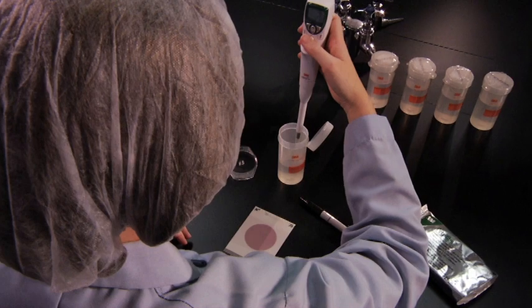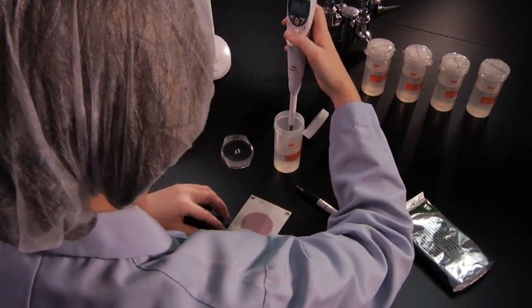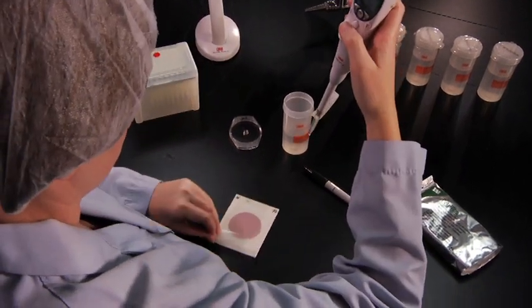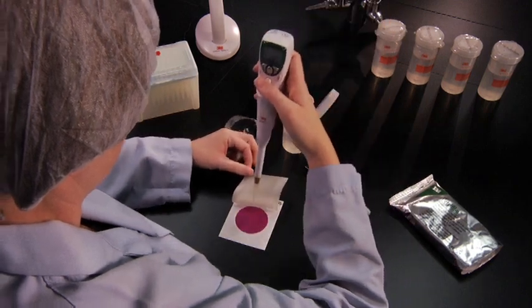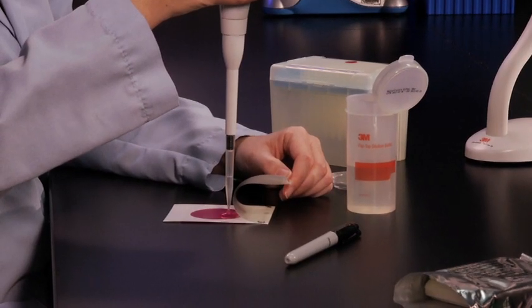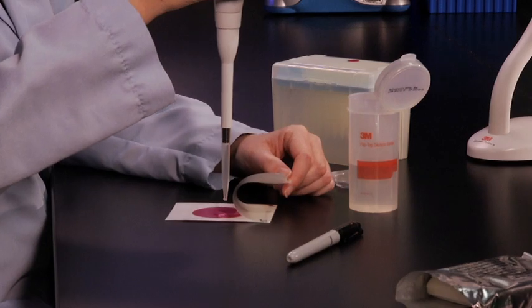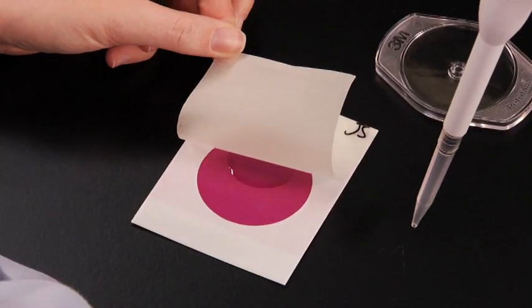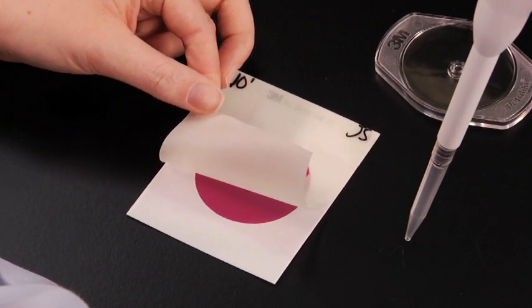Draw 1 mL of sample into the pipetter. Then, lift the top film and hold the pipetter perpendicular to the 3M PetriFilm plate. Pipet the sample onto the center of the bottom film. Carefully roll the top film down to avoid entrapping air bubbles.